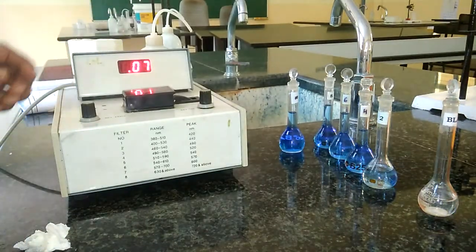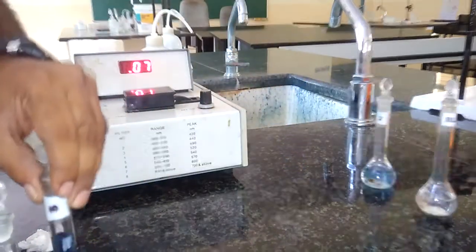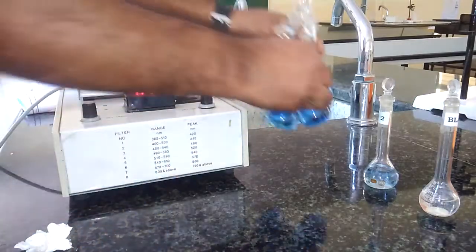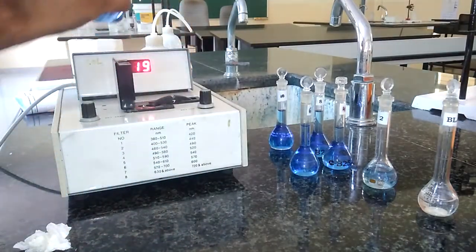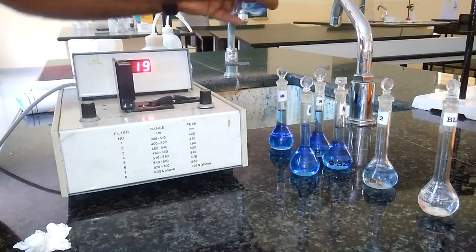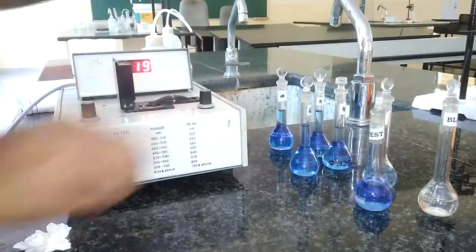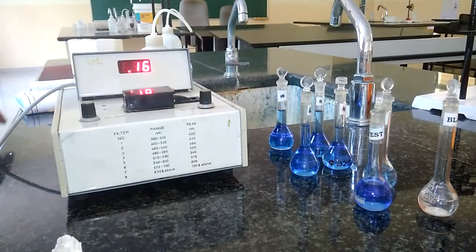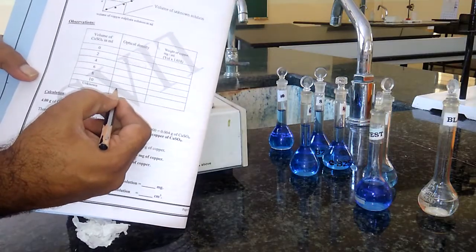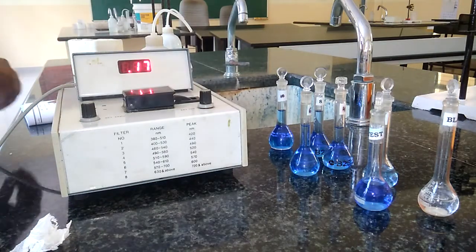Similarly, we have to record the absorbance of all the standard solutions: 4 ml, 6 ml, 8 ml, and 10 ml. After recording all standard solution absorbances, we also record the absorbance of the test solution. Rinsing the cuvette with the same test sample, filling to three-fourths, wiping well, then keeping it inside the colorimeter. It is giving 0.16 or 0.17 — 0.17 for the unknown solution. So the optical density for the test solution is 0.17.